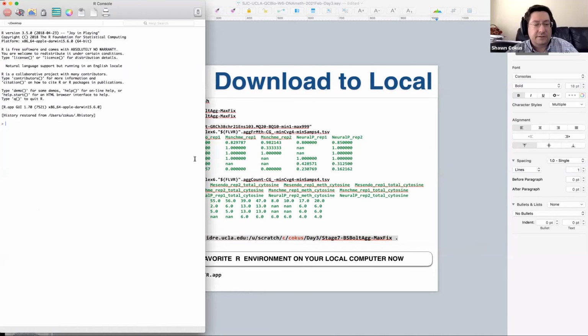Okay, so R. Now, can you guys see this R window? Is that showing up? You're probably in RStudio or something, but somebody tell me if you can see this. Yes. 1014. Yeah, that's current. Okay.